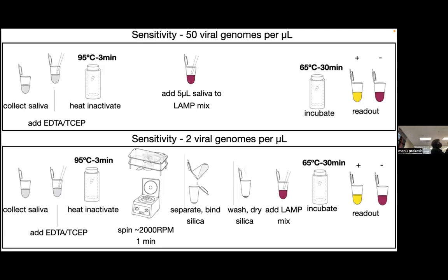I'll pass this around. You're pumping energy that leads to something spinning. Again, all of these are much, much slower than what we can do in the paperfuge. But one of the interesting things about this is that we can include a little bit of electronics. We can build a little detector so we can electronically test. So this one has a load cell and a Hall effect sensor, so we know exactly what RPM.